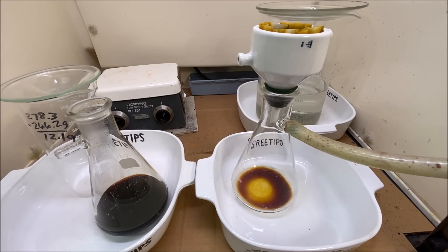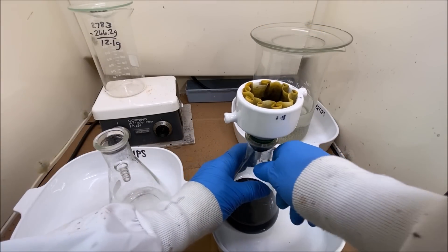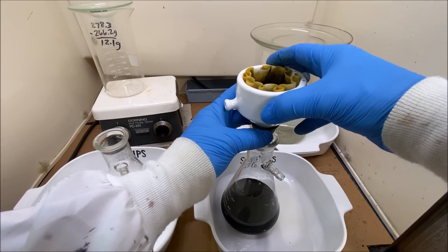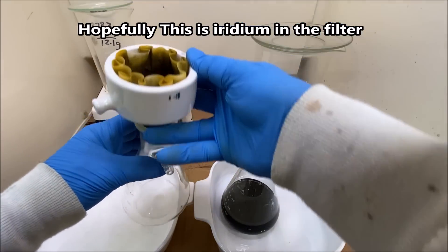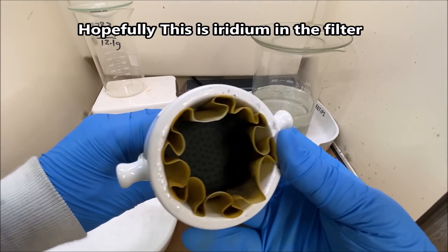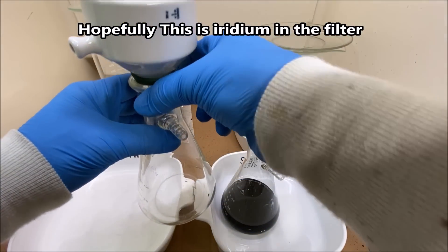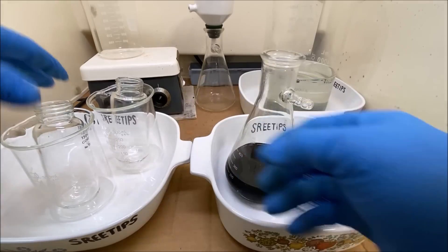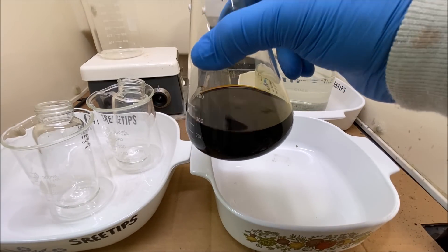I've had this through the filter about three times now, and we were able to get some more of the black stuff out — it's down in the bottom of our filter. I'm just going to set this back out of the way. I'm not quite sure what to do next on how to get the suspension out of my platinum solution.